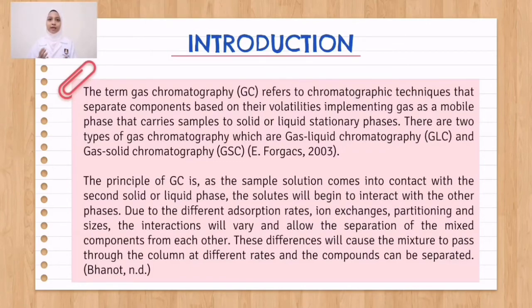The term gas chromatography refers to chromatographic techniques that separate components based on their volatilities, implementing gas as a mobile phase that carries samples to solid or liquid stationary phases. There are two types of gas chromatography, which are gas-liquid chromatography and gas-solid chromatography.